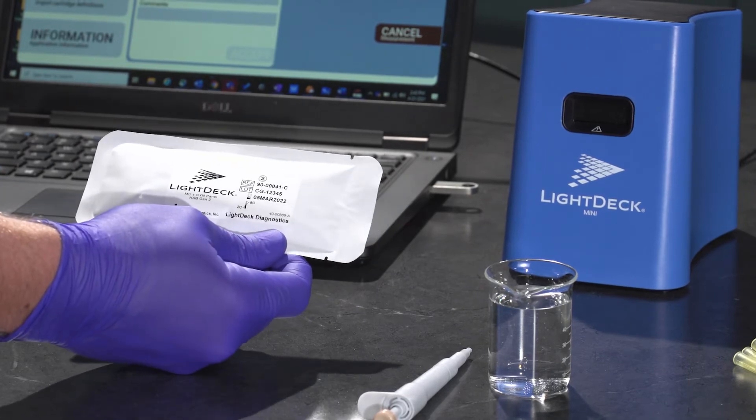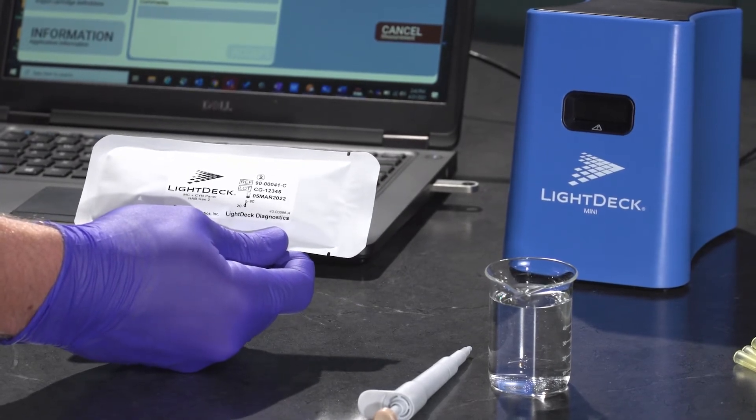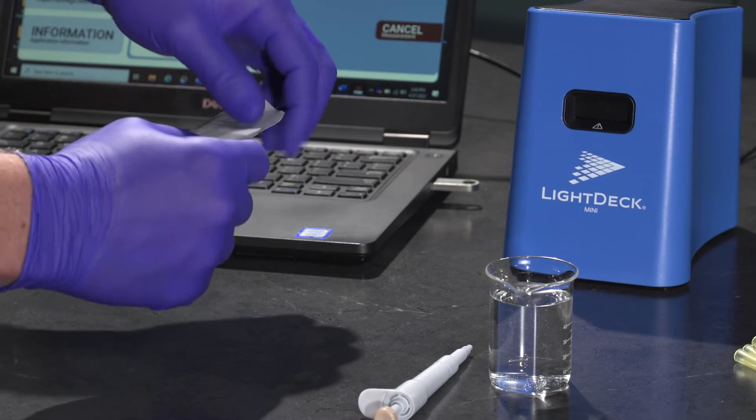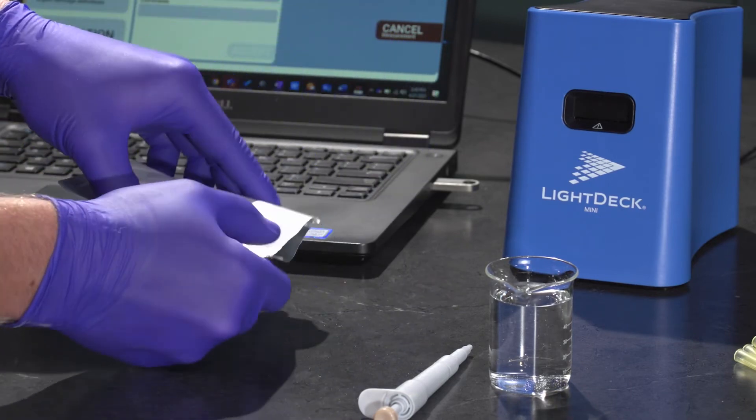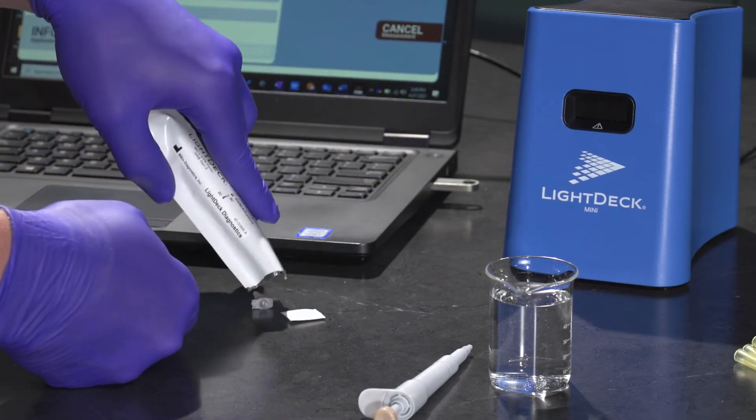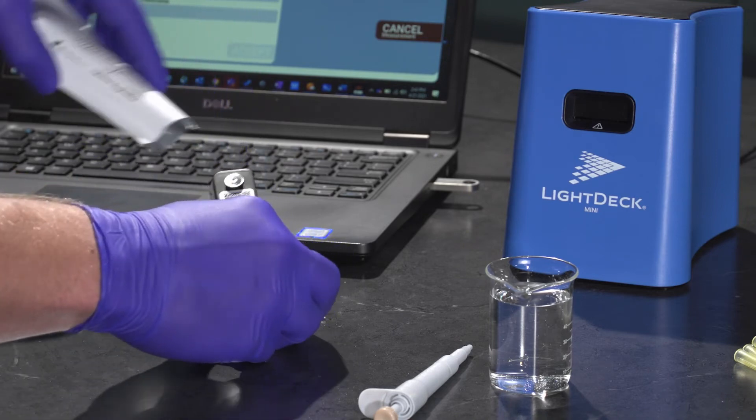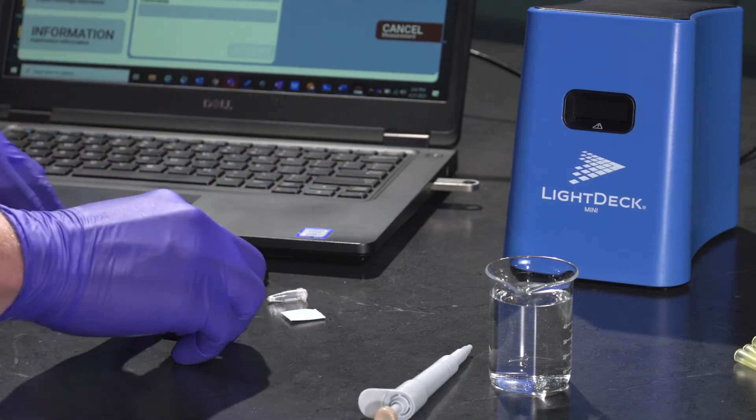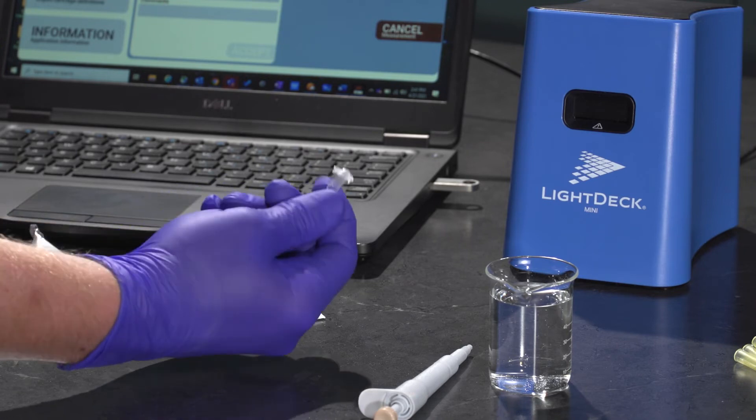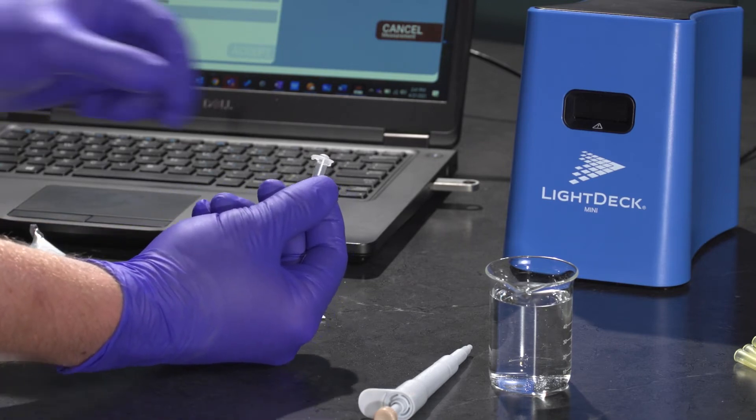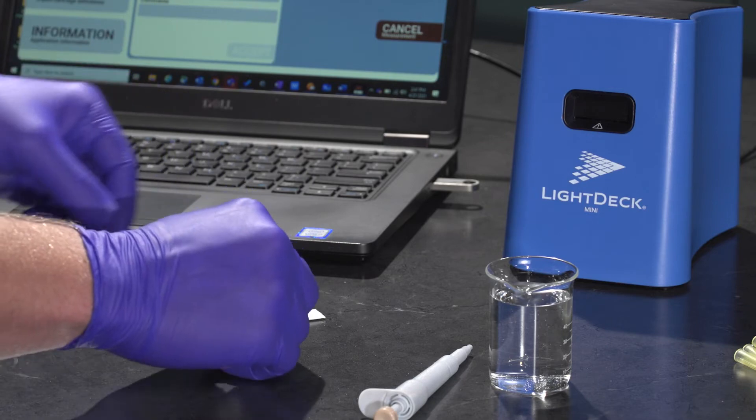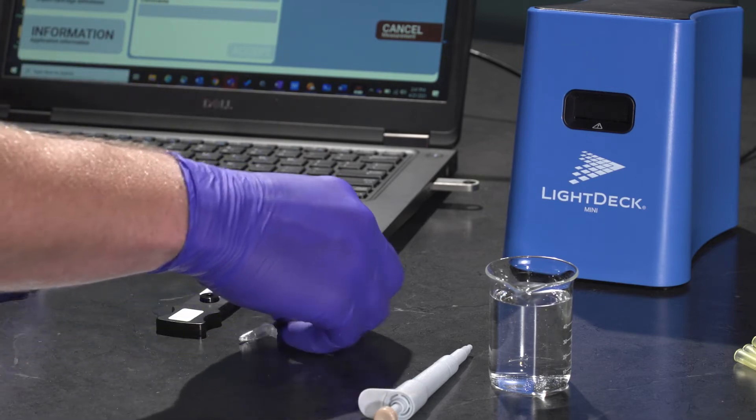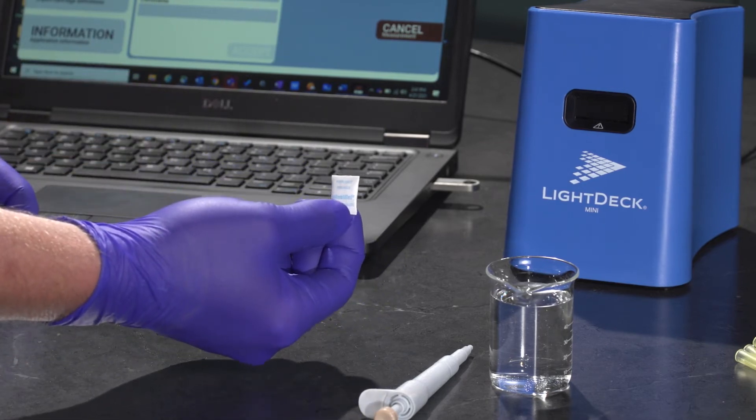Next, open a test cartridge packet with the included pull tabs at the end of the packet. Inside of that test cartridge packet, you should find the test cartridge, a tube with the reagents at the bottom of the tube, and one desiccant packet as well.